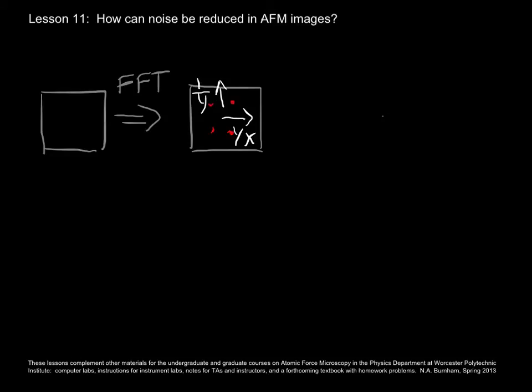The brighter the color, the more amplitude, and then you apply whatever filter you choose to use.